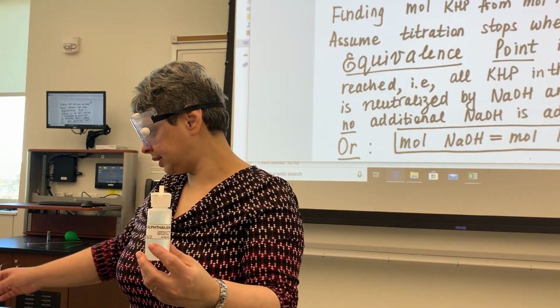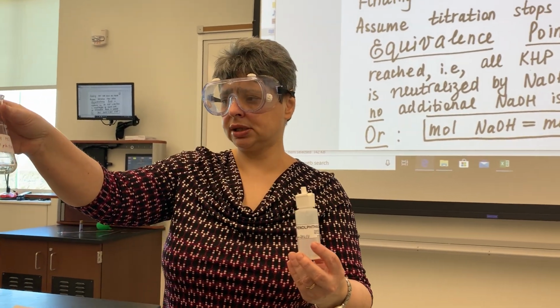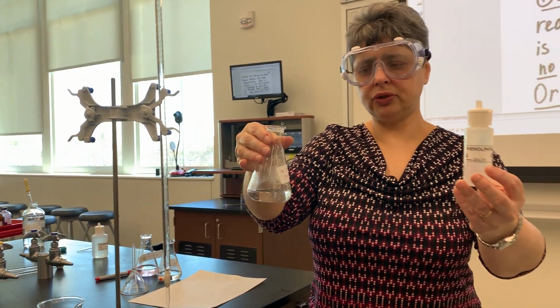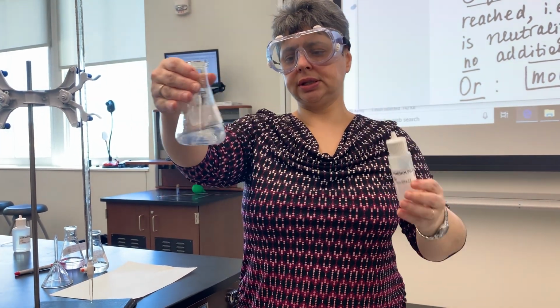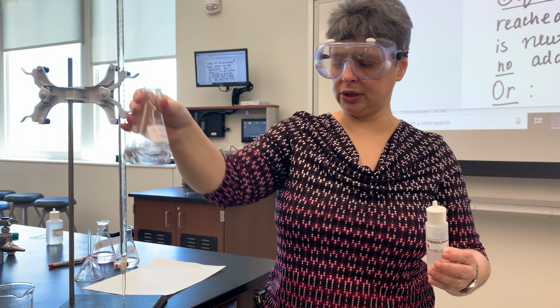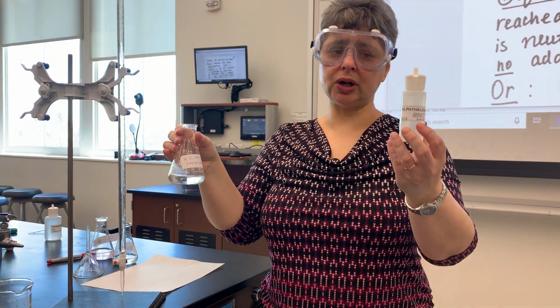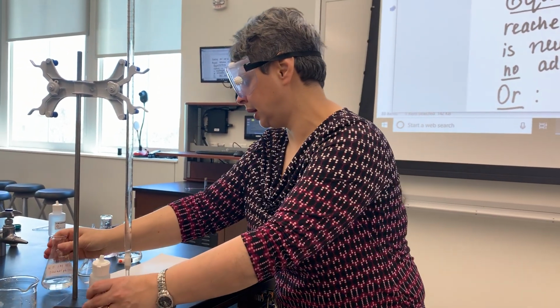I have several flasks here that I wanted to show you. Here I have some acid. It's actually hydrochloric acid and water. And I'm going to add some phenolphthalein. We're going to see what happens. As you can see, there's pretty much nothing happening. The solution is still remaining clear and colorless. So the bottom line is phenolphthalein is colorless in acid and the neutral medium.